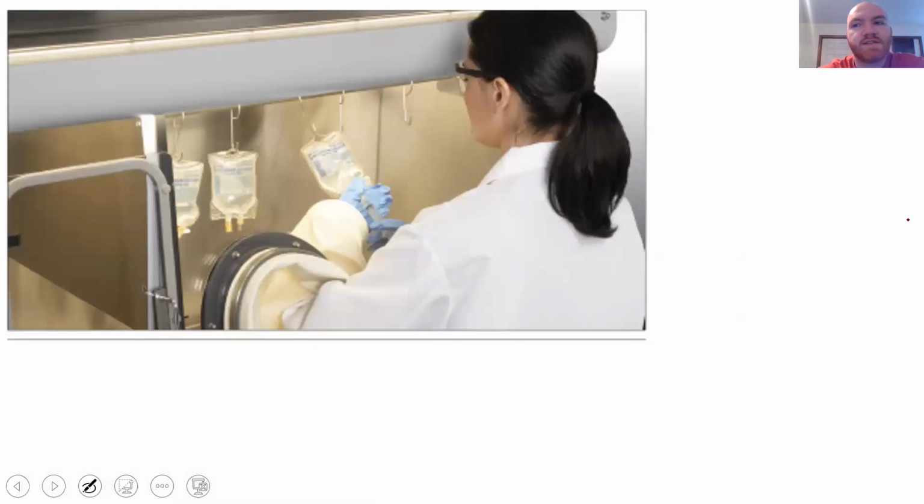Now, one of the advantages of these is there are regulations where you can put these in just about any room. You can just plop them down and start working. So you can see here, this person is not wearing any garb. This lab coat is not considered clean garb, and she's not wearing a mask, a hairnet, none of that. She's just wearing safety glasses. So that is an advantage of these.